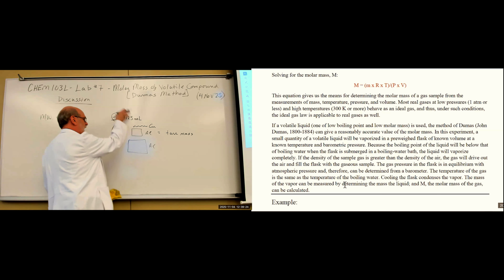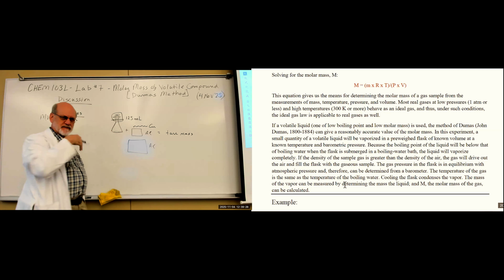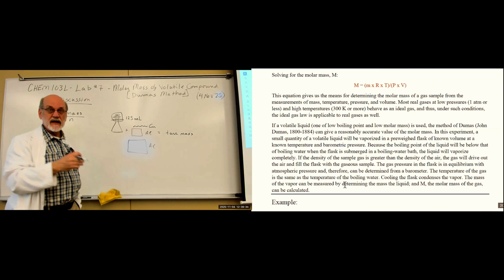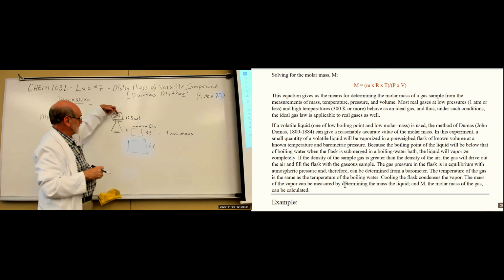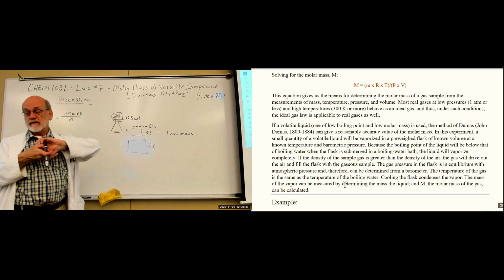If we use this one on the outside and secure it enough, then as you're trying to vaporize the liquid in a boiling water bath, you're going to get vapor all over the place. It's easy enough to dry off the outside of the glass, but if any vapor gets up underneath this little one or on it, then that's difficult to get rid of.